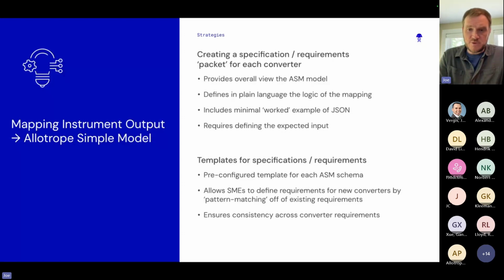And very often we have to say, these things need to have specifications. You have to say, we expect this format from this instrument. And that might not be all the formats that instrument produces. And then taking this one step further and actually trying to create templates of this, so having a pre-configured template for each of the ASM schemas that we're trying to target.